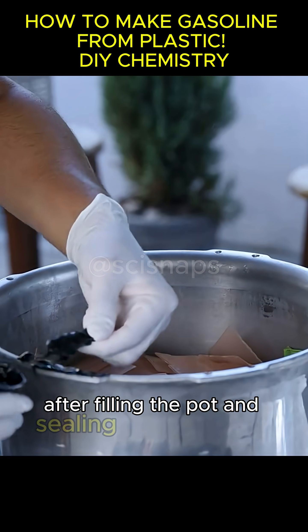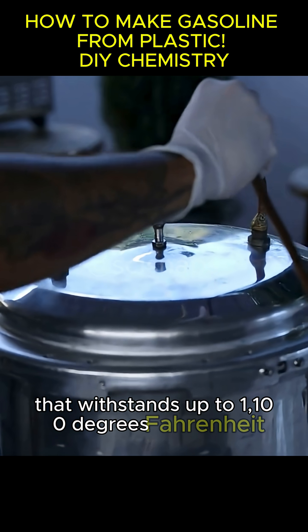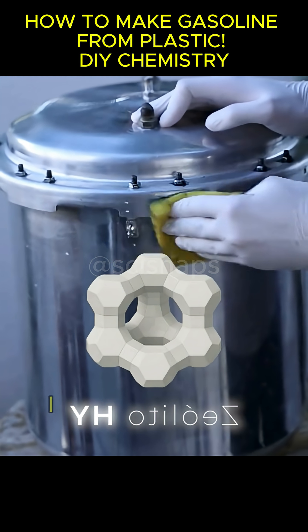After filling the pot and sealing it with an epoxy that withstands up to 1,100 degrees Fahrenheit, it's time to make the HY zeolite. This is the most complex part of all. I found a section in an inorganic synthesis book describing how to make Y zeolite, but it wasn't.